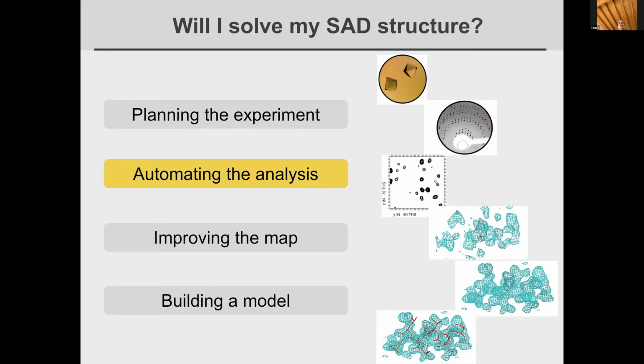Well, one is through non-crystallographic symmetry. Another is through density modification. And another one is if there's a lot of solvent, that's going to improve your density modification a lot. So basically, whether the low figure of merit is going to be a fundamental problem is going to be determined by whether or not you're able to improve the phases afterwards.